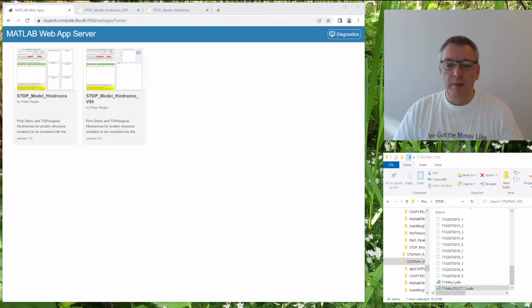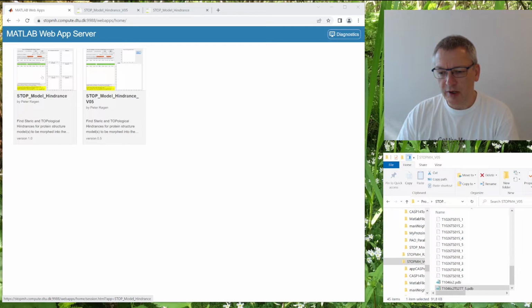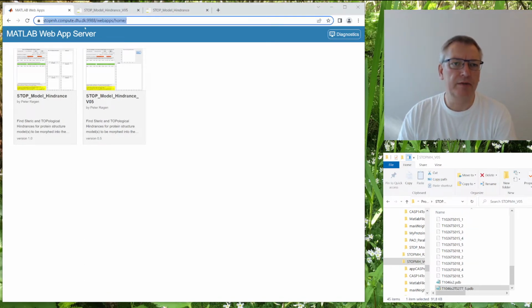Hi, my name is Peter Røen, and in this video I'll just shortly show you how to operate my server for checking if there are steric or topological obstructions or hindrance for aligning a protein model to the correct 3D structure of that protein. You will find it at this homepage.